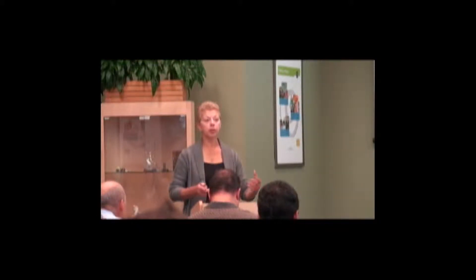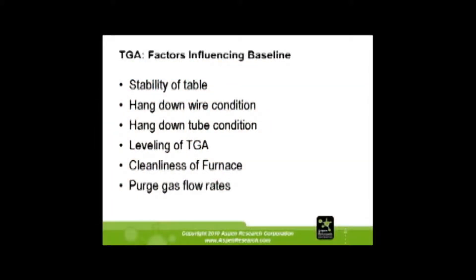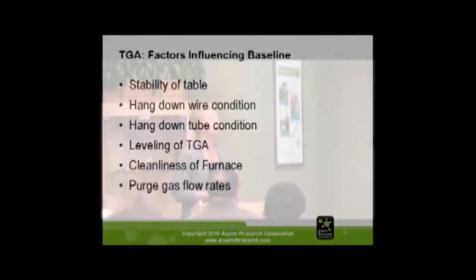Factors that affect the baseline: stability of the table is a big one. If people are slamming doors and banging nearby, you really need something that is not going to be moving around so that the balance is not jarred. Hang-down wire condition — if there is soot or dirt near that wire, it can influence your numbers. The wire and the pan can get dirty, so sometimes you have to go to a thousand degrees, let it sit, and burn it all off. Leveling of the TGA is important, as is cleanliness of the furnace and purge gas rates. If you purge too fast, you also have the pan vibrating in the air.